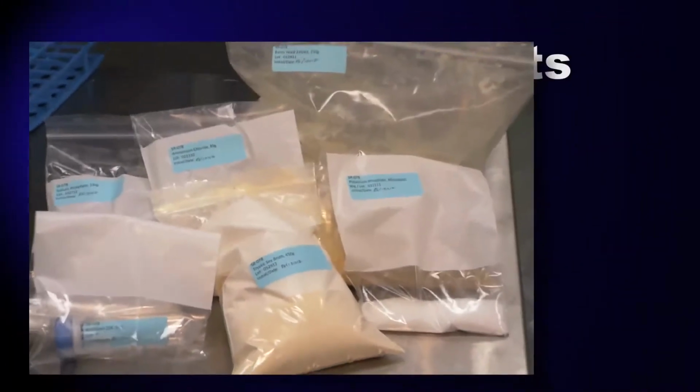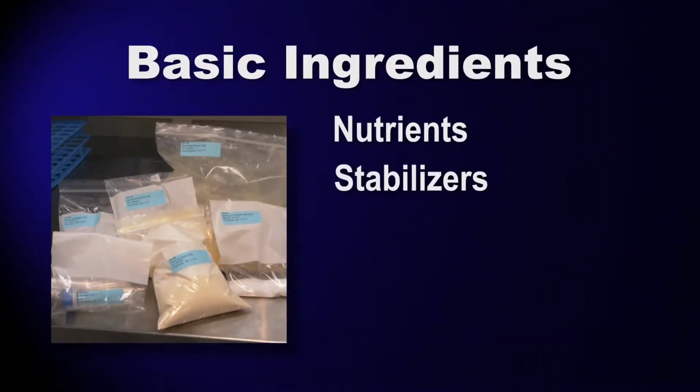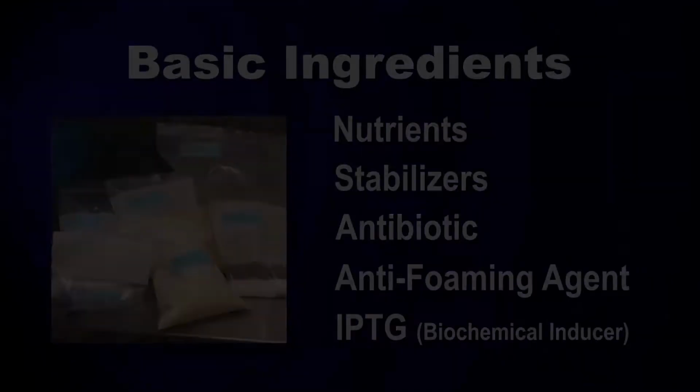The basic ingredients for a compatible media include nutrients, stabilizers, an antibiotic, an anti-foaming agent, and IPTG, which is the biochemical inducer that switches on the GFP gene.